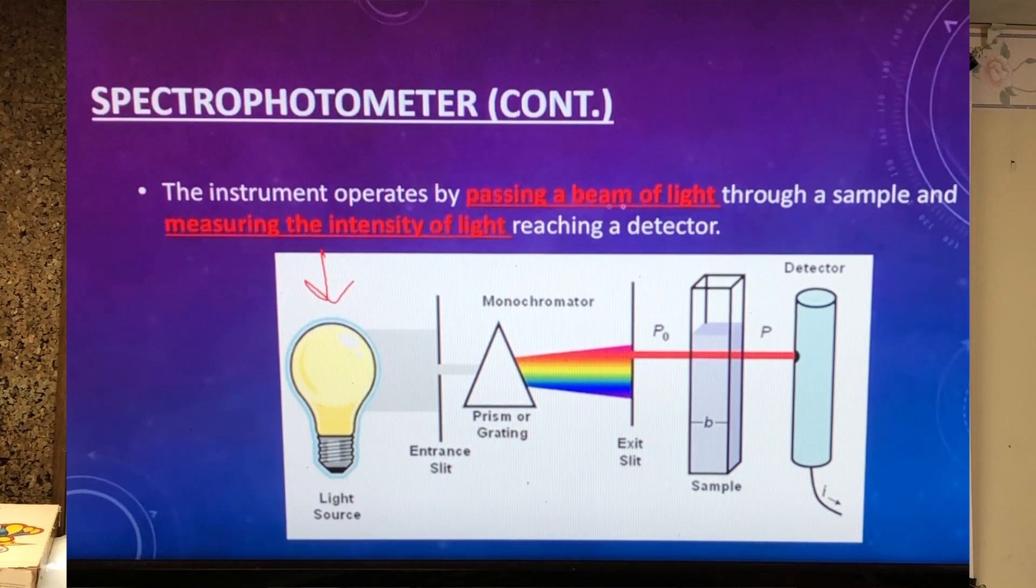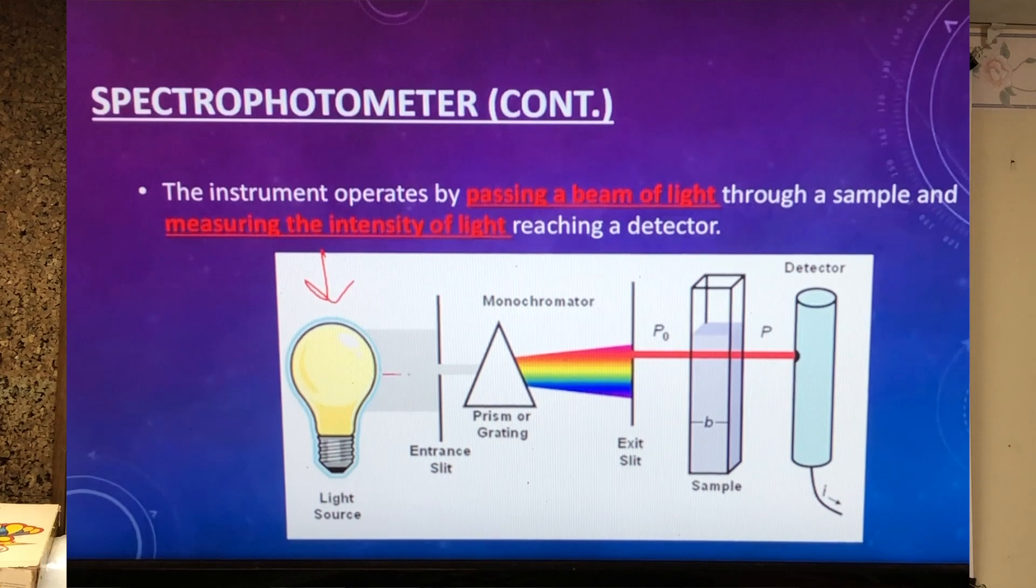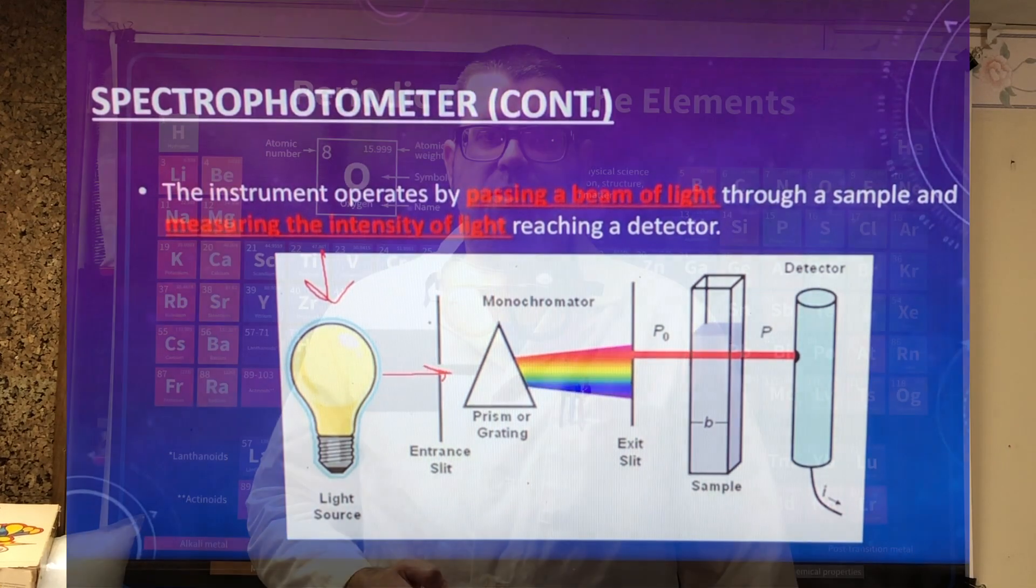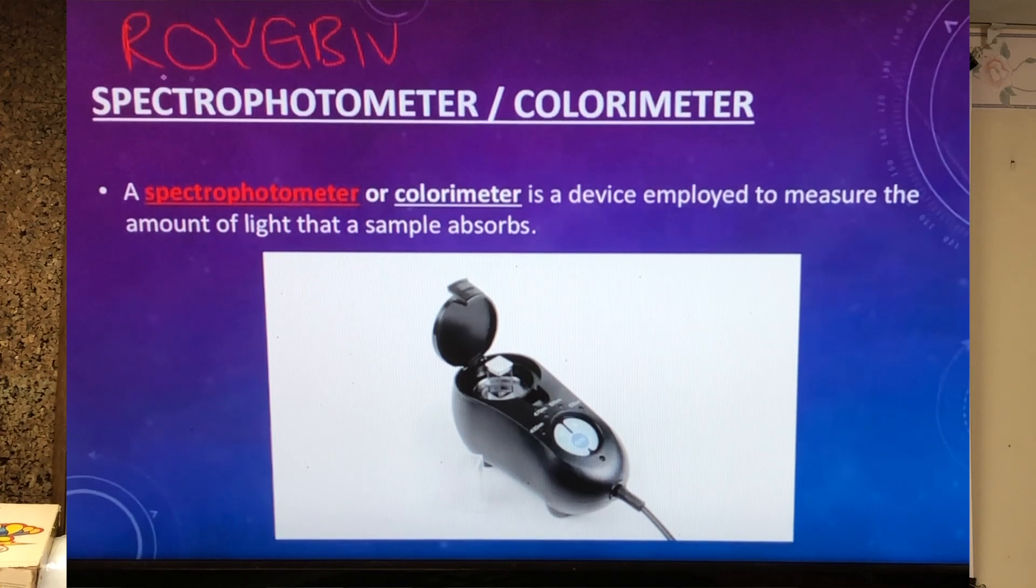When you pass a light through it, some of that light will be absorbed. And when that absorbance occurs, then you have a measure of concentration that you can derive from that. The instrument that will be used today is something called a colorimeter. It's a type of spectrophotometer. When spectrophotometers are used, they scan the entire wavelength of color in the visible spectrum and find a wavelength of light that gets absorbed easily by the solution.